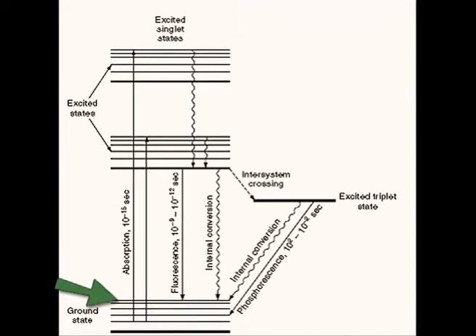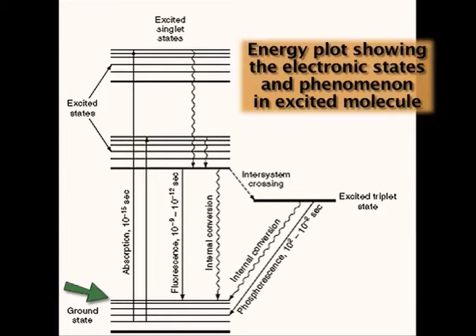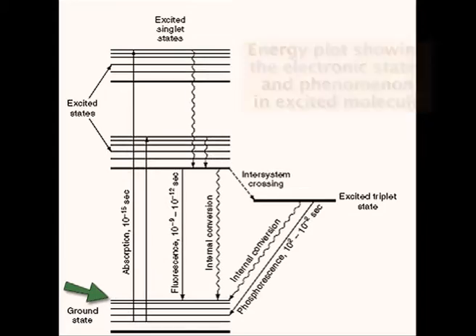Now, what is fluorescence? Fluorescence is an emission phenomenon. So when an incident light comes and interacts with a fluorophore, which is a chemical compound, first the electron goes to its excited state or excited electronic state as I call it. Now once it goes to the excited electronic state, it tends to come back to the ground state. This is known as relaxation.